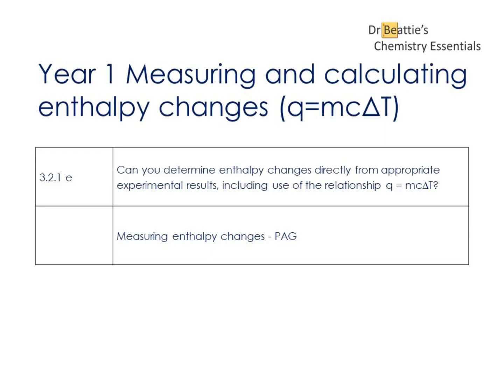In this lesson we're going to be looking at measuring and calculating enthalpy changes using the equation Q equals mcΔT, which forms part of a specification point as well as one of the core practicals or PAGs that you have to do in A-Level Chemistry.